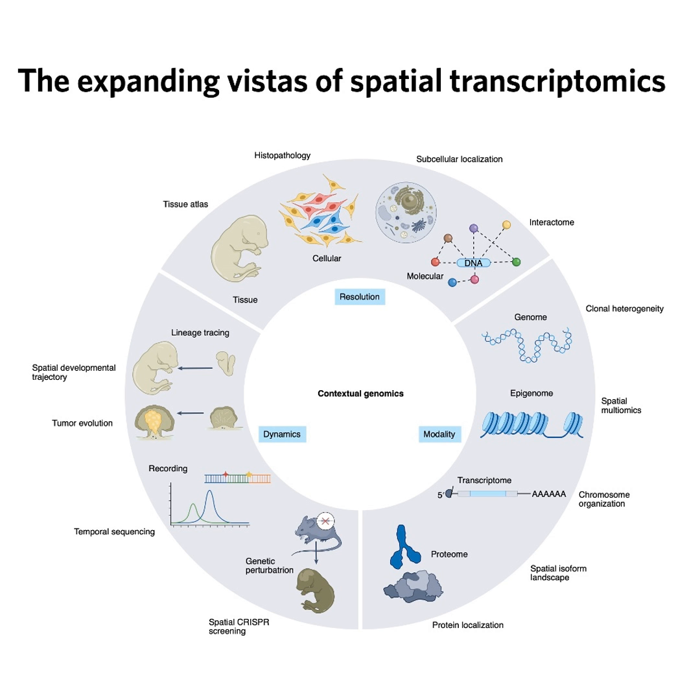Okay, so we have these two incredibly powerful paths, barcoded capture with sequencing, SST, and combinatorially coded imaging, IST. Both are giving us just unprecedented spatial molecular data. But our sources strongly suggest this is really just the dawn of contextual genomics. What comes next? Where is this heading beyond basic ST? Yeah, I think that's right. ST is foundational, but we're already seeing innovation pushing along 3 major trajectories. First, expanding the types of molecular modalities we can measure spatially. Second, relentlessly pushing for higher resolution. And third, adding the dimension of time, moving towards what some call 4D biology.